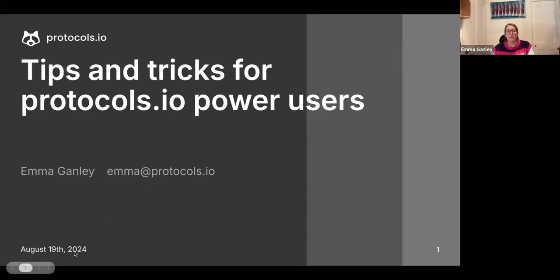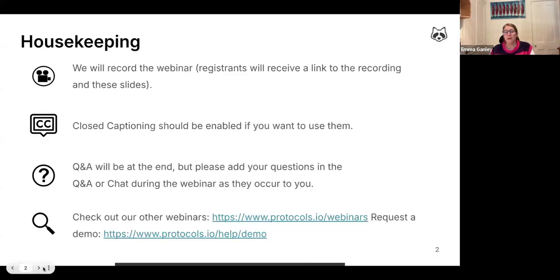That's started. So welcome to the webinar. I will run through a bit of an agenda, but then it will pretty much be live demo, as long as my internet complies, to show you the platform and the functionality that I want to illustrate today.